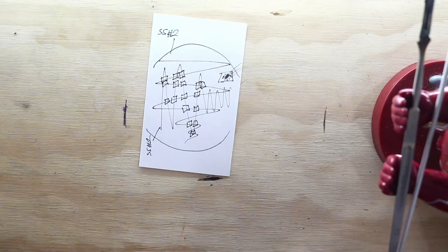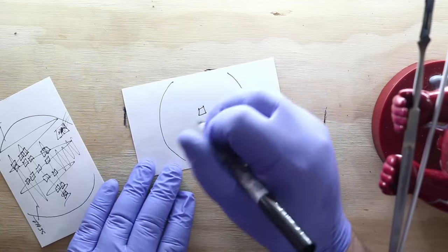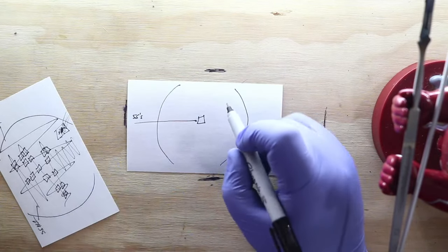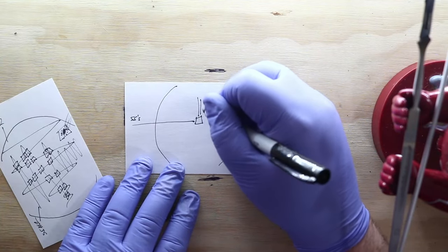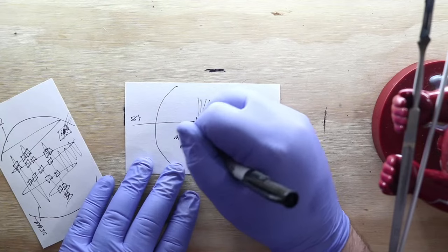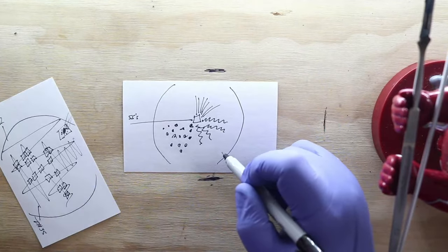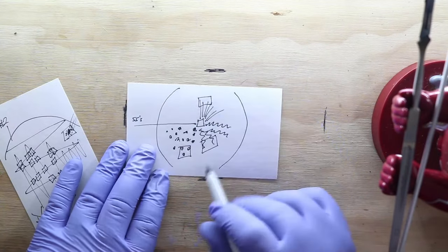When that grows, a lot of times you'll do your new transfer from a spore streak dish, and what you're going to see most likely is that you've picked up more than one colony. This colony grows like this, and this colony grows like this, and this colony grows like this. Obviously, that's not how it grows, but you know what I mean. Then you can take cutout points of each of these and transfer those to a new dish.